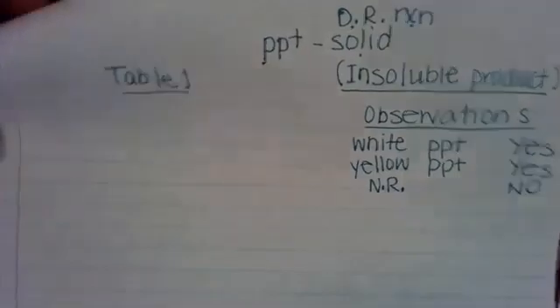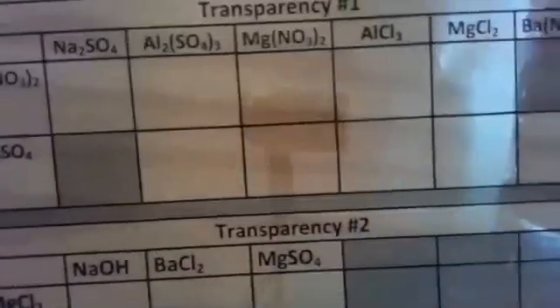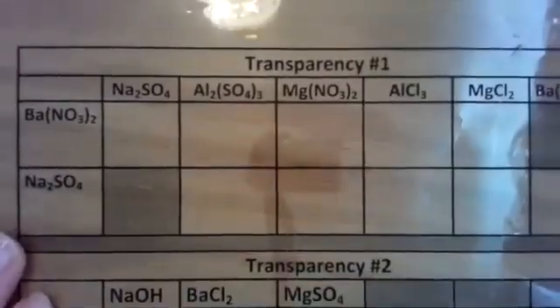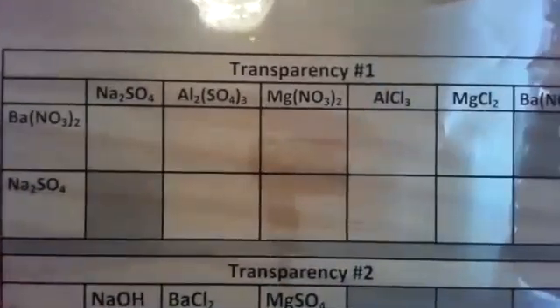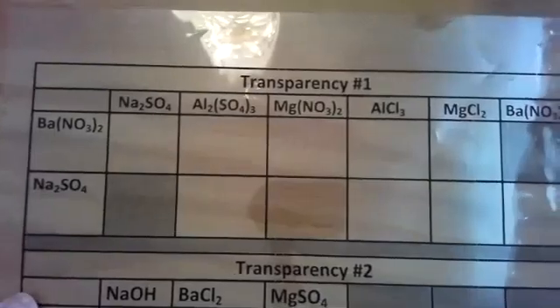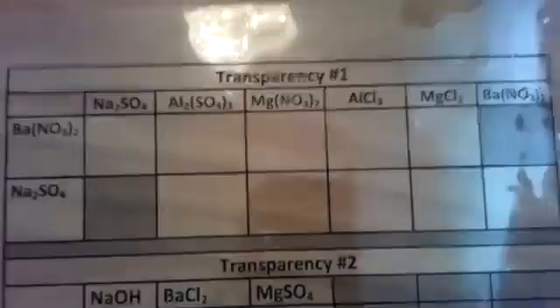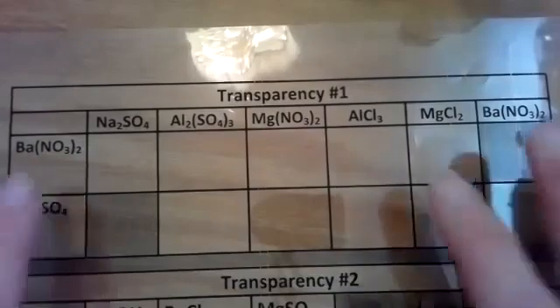Okay, so I do know obviously which reactions occurred and which didn't. So we will do most of the reactions, but we won't do all of them because there are some of them that just don't react, and so I won't have to do them all. But I do want you to get a visual of what reactions look like when they occur and they don't in a larger quantity than just the one that we saw yesterday. So yesterday's demo, you saw one of them occur and they had a yellow precipitate that formed. So let's get started.